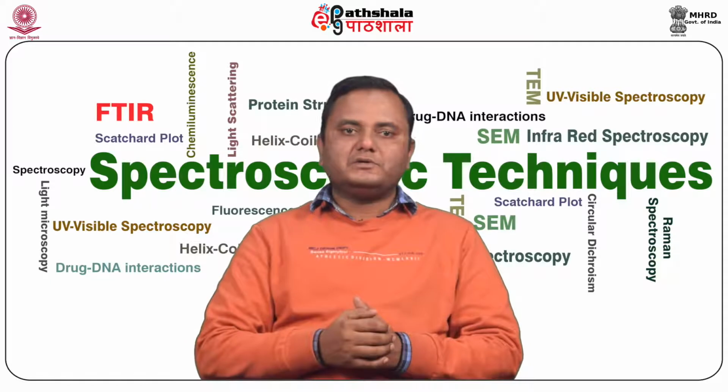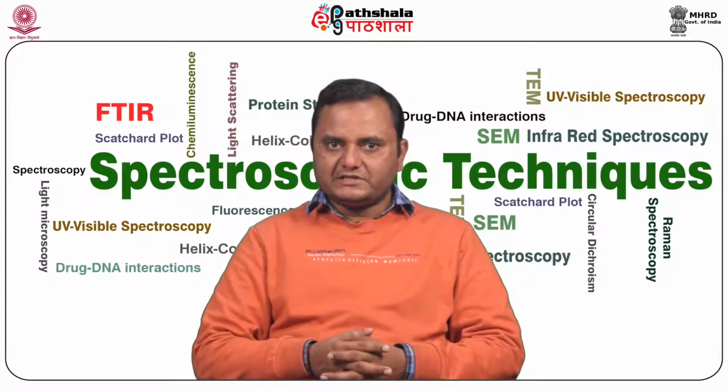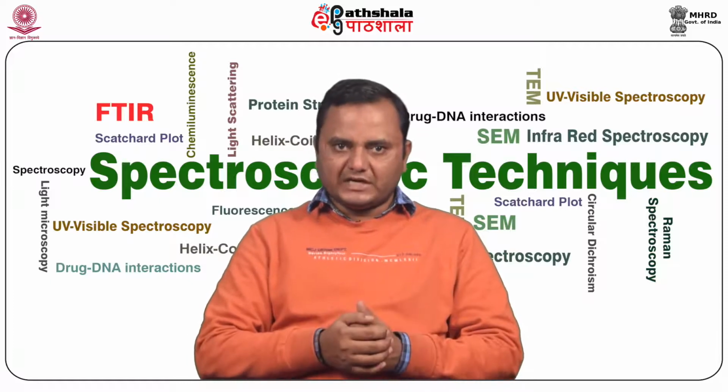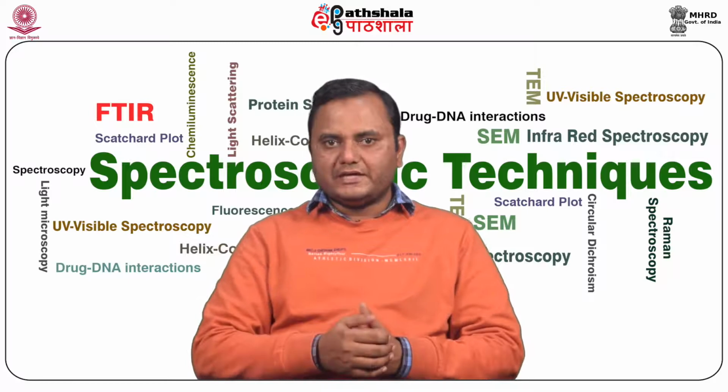However, the backbone or amide bond is detected in the far UV region, where the n to pi transition occurs at approximately 210 to 220 nanometer.